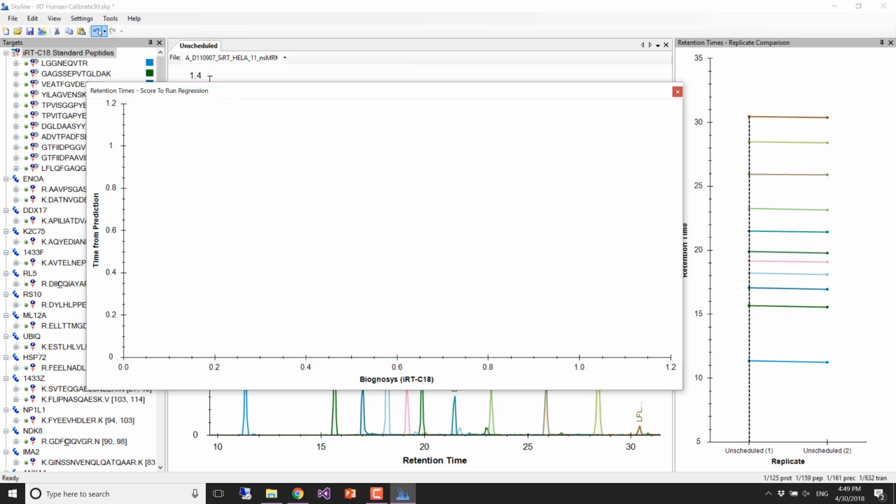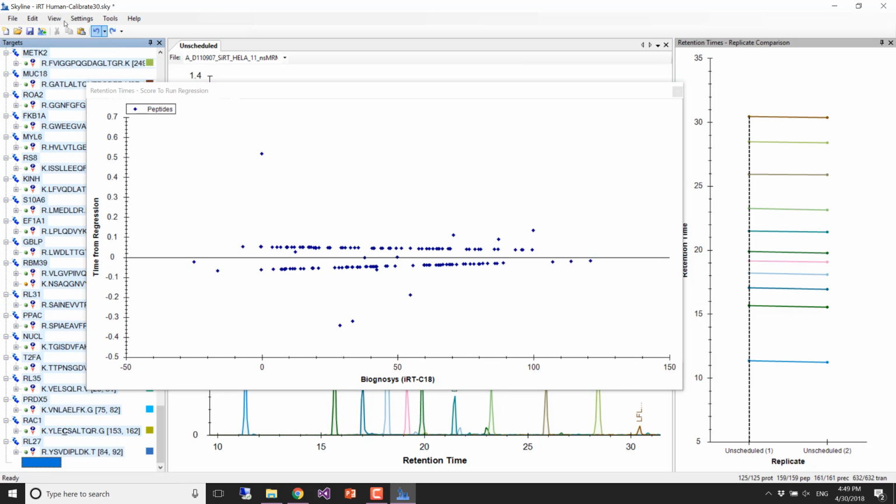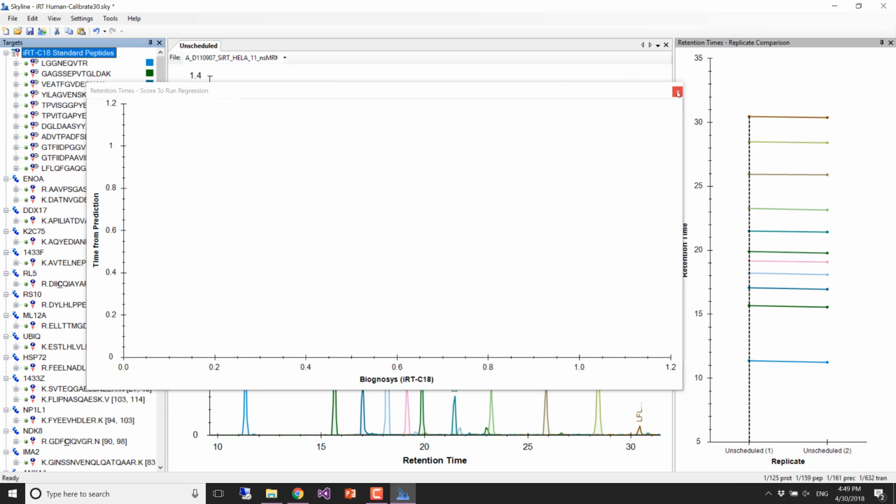But anyway, so, okay, we'll do undo for a second. And you can see the residuals aren't perfect. They're actually frequently, and this must have to do with some sort of rounding error, less than 1/10 of a minute away from the line. So anyway, I think I'm just going to redo just to be safe. I don't quite know.